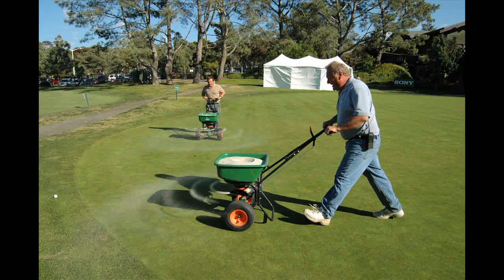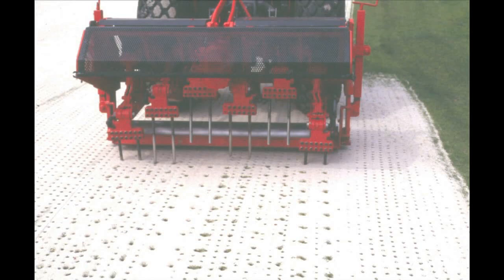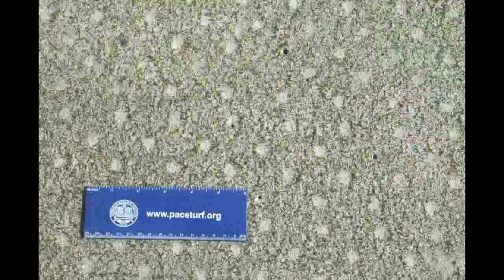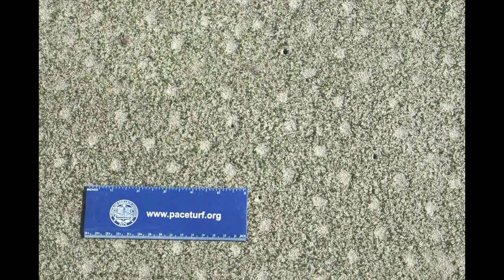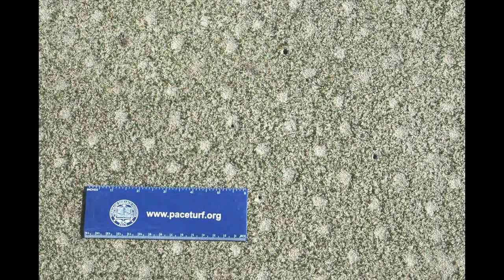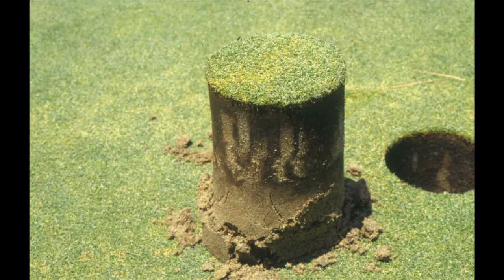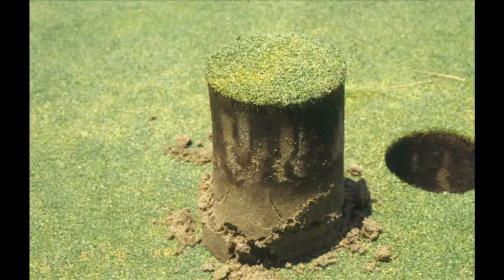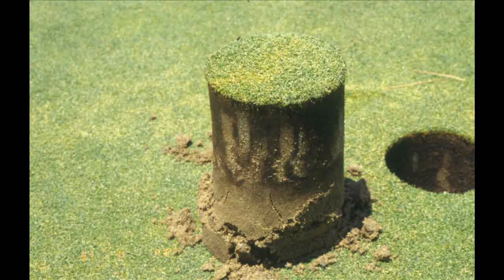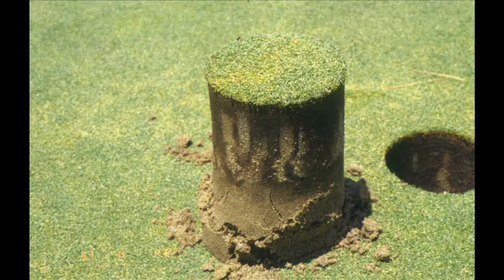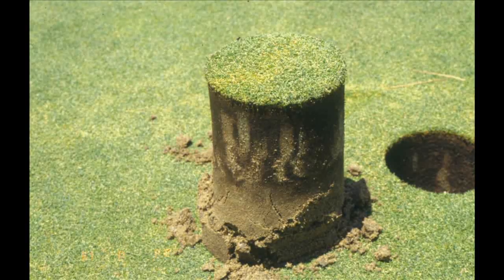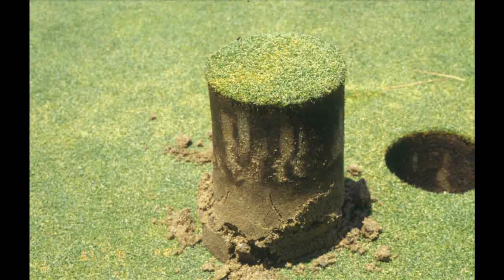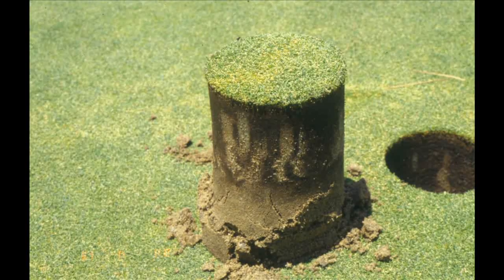Whether you're light top dressing with sand or you're heavily sanding and filling holes with sand, it's always good to use a USGA specification sand. This quick method of evaluating sands doesn't replace a full A2LA USGA spec sand analysis conducted by a certified lab. But it does give you a quick read on the different types of sands that are out there, and maybe will help you to select sands before shipping off a sample to the lab for a full analysis. And then during the delivery process, you may want to run a few samples and take a quick look at these particle size distributions just to give you a better feel that you're getting the right kind of quality of sand from your sand supplier. We hope this video is helpful and take a look at the links associated with this video and the associated update that contains the spreadsheet that we demonstrated here. Thank you.